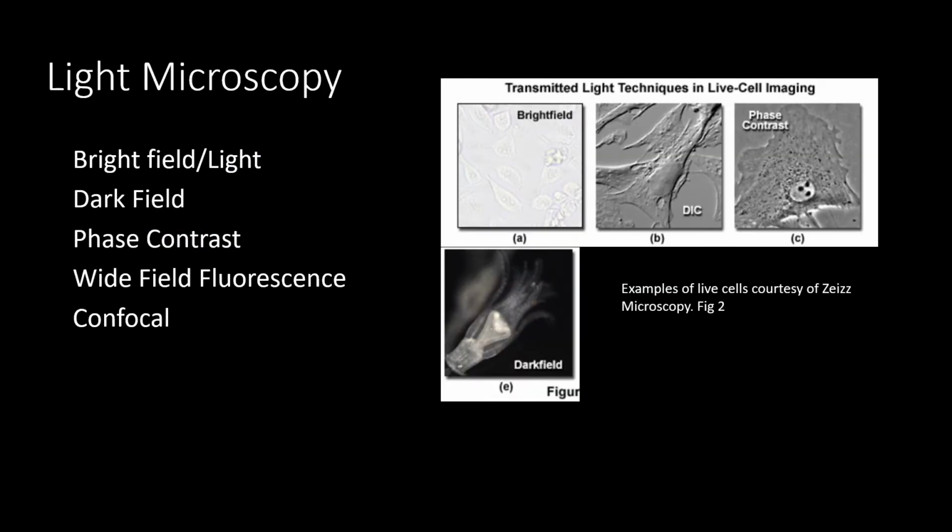Light microscopy is the most common form of microscopy. Bright field, the most generic form of light microscopes, is best with either alive or naturally colored specimens, or dead and stained. In the picture here, you can see that live translucent specimen barely shows up, so we won't be able to use bright field to visualize Vibrio fischeri. Instead, we'll take a look at these other microscopes.